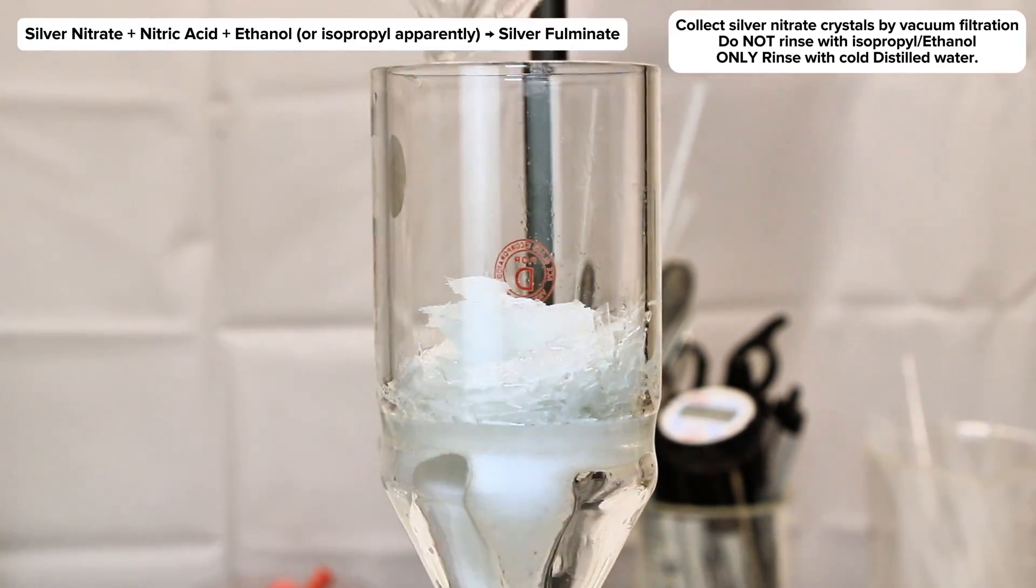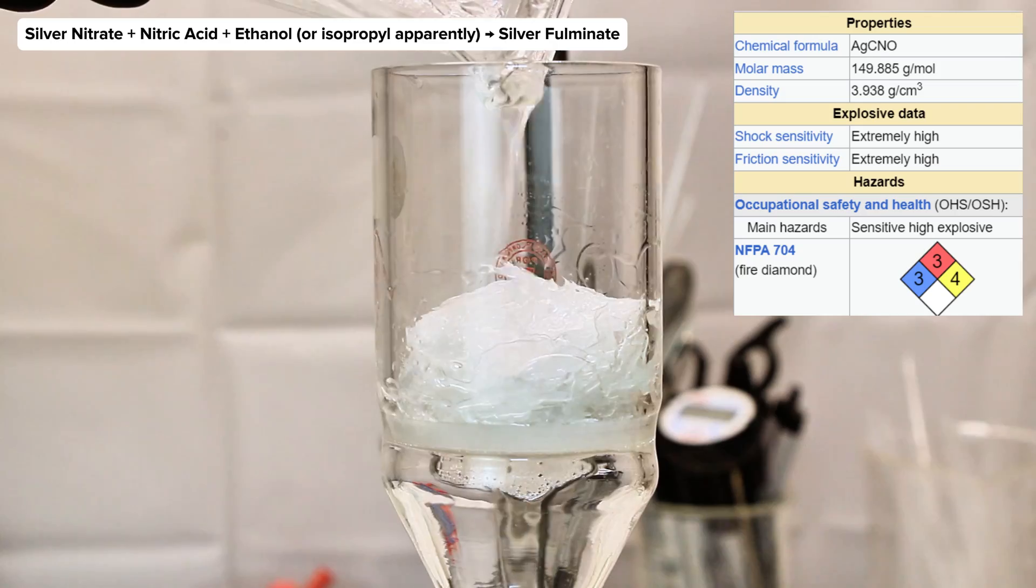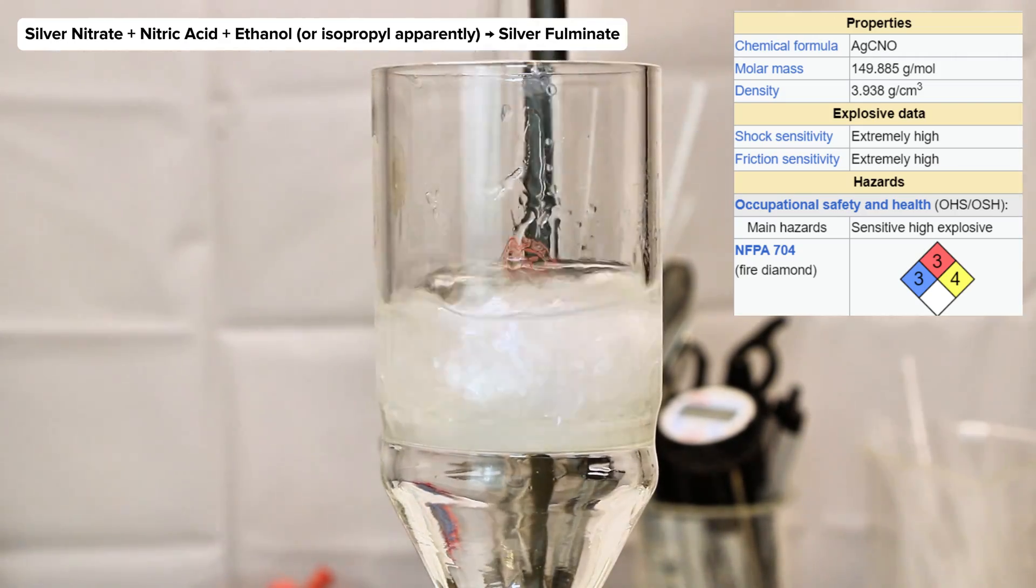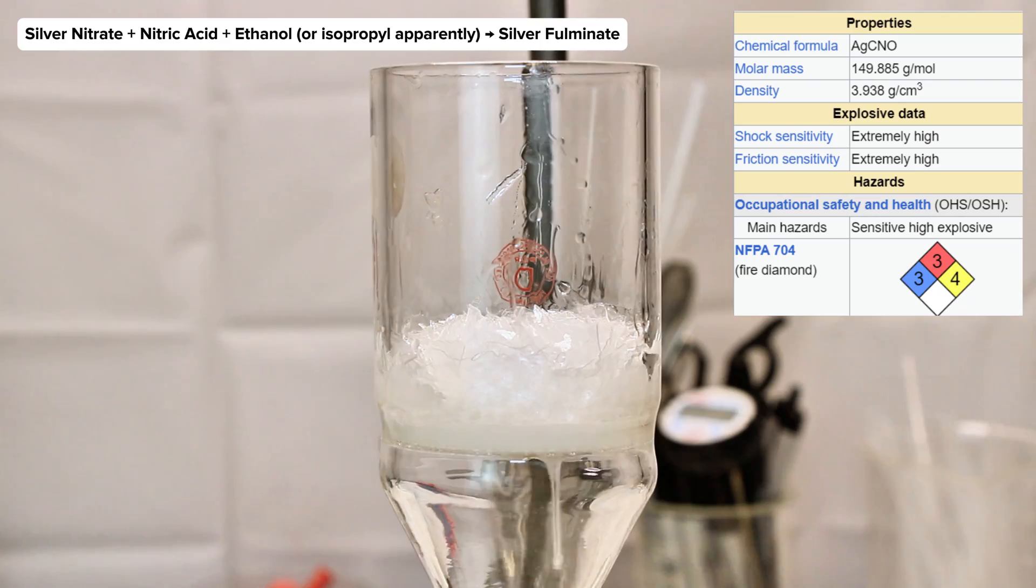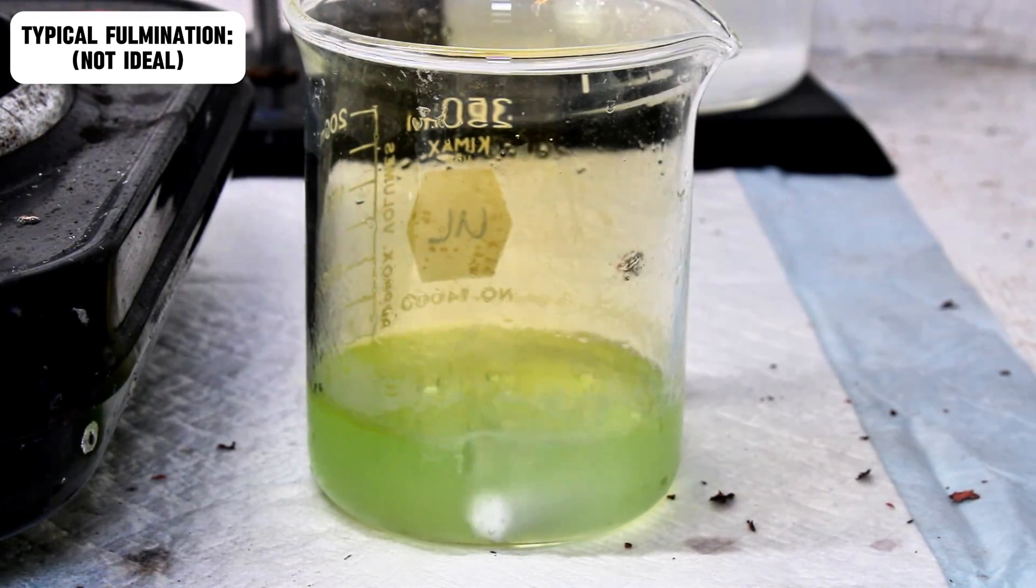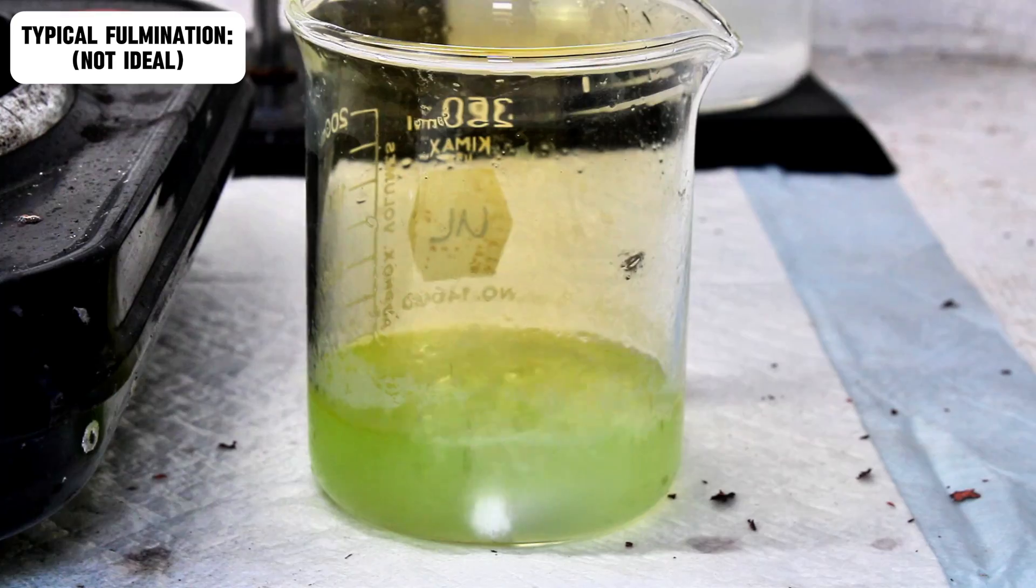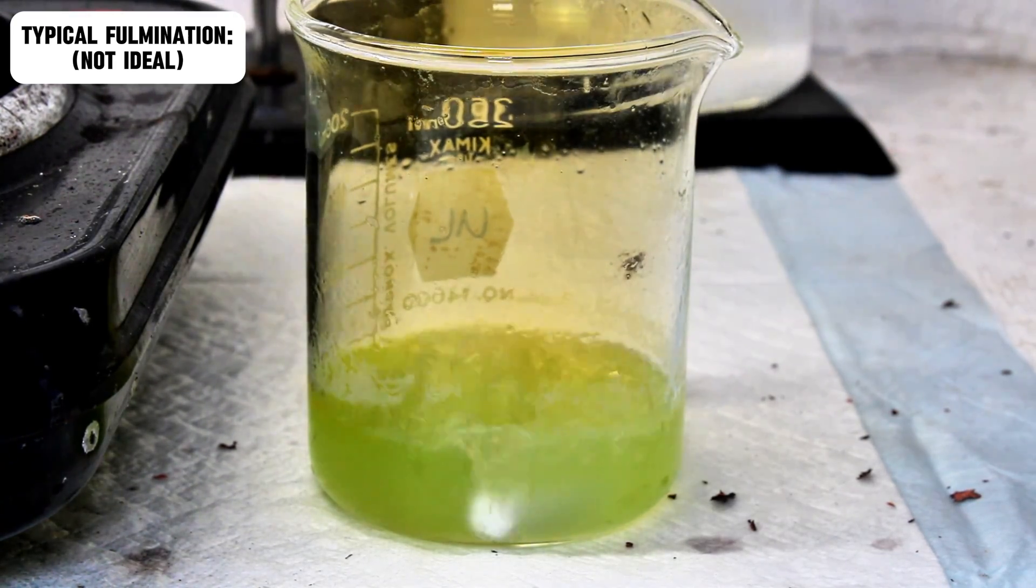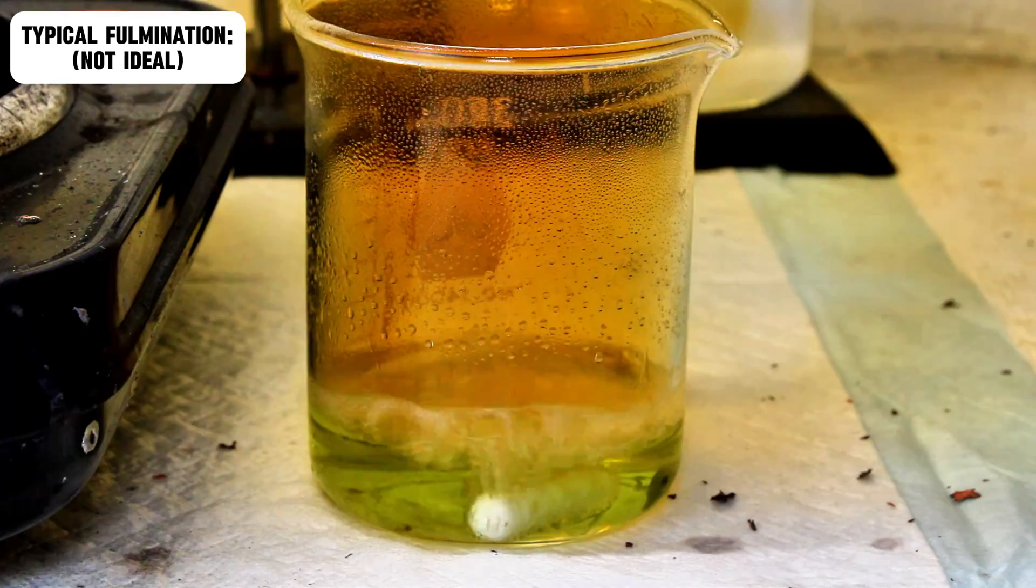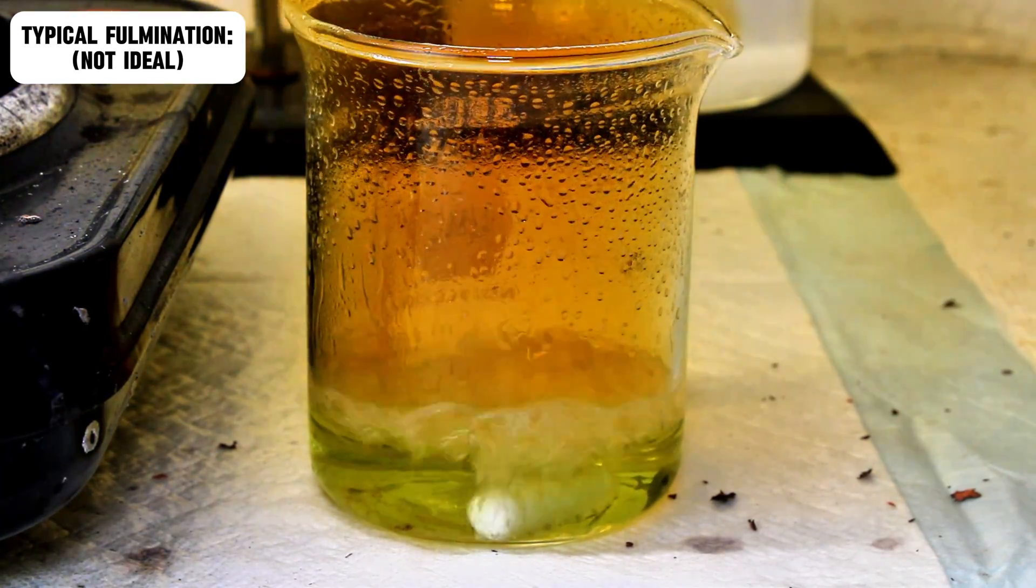I obviously knew this was a thing, I've done it several times intentionally, but what I was not aware of is how favorable this reaction was, or that it could proceed using isopropyl rather than ethanol, or at all in such a dilute solution. Turns out that it can. And that said, only about 5 minutes after rinsing my silver nitrate, the filtrate began a very characteristic fulmination. This was not desirable.